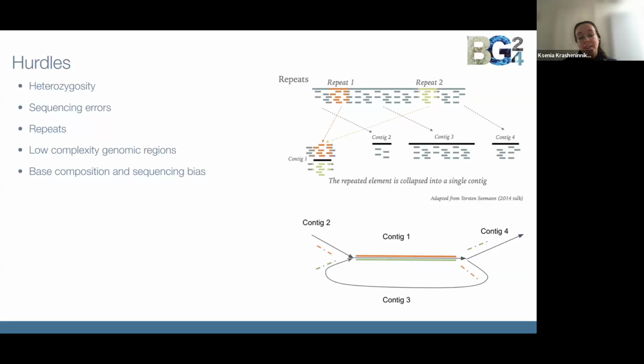Now we can get back to the factors that can affect assembly generation. Let's, as an example, take a genomic repeat shown on the picture and see how the region might look in an assembly graph. If the repeat length is bigger than the length of the reads spanning the area, it will result in a structure where the unique sequences linking the repeats on both sides will form distinct graph edges. So here is a repeat, and here are the flanking sequences.